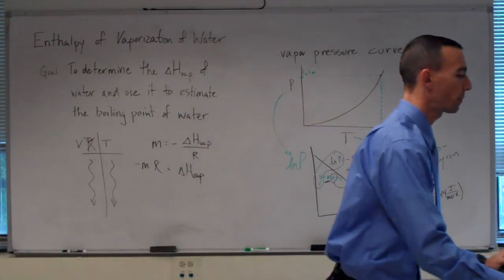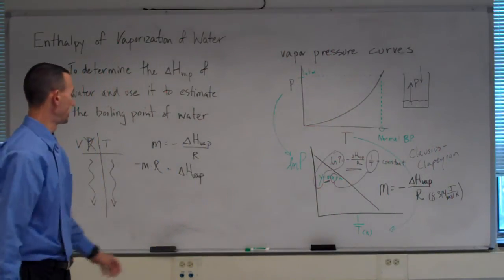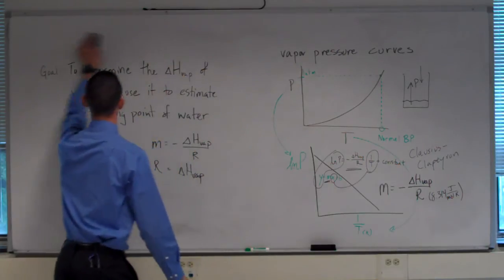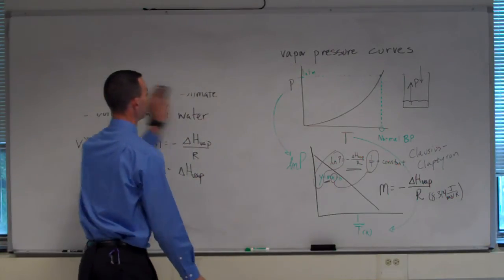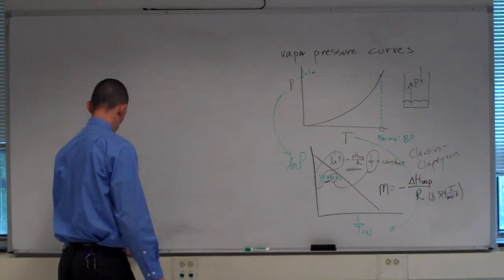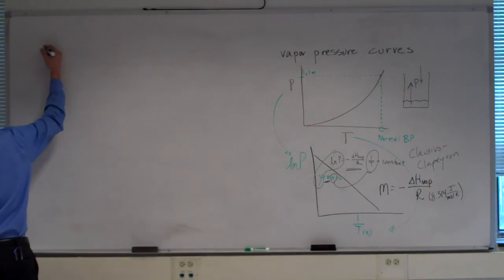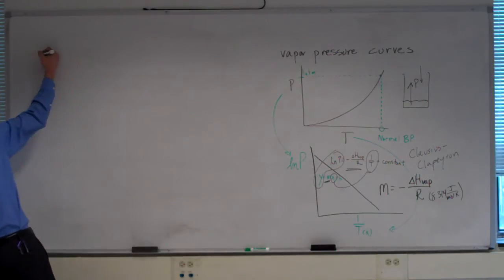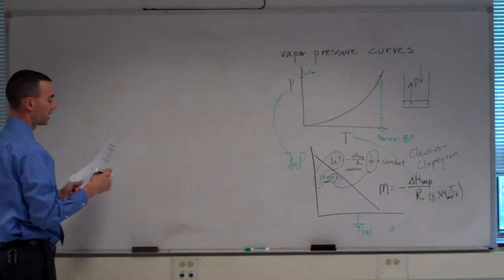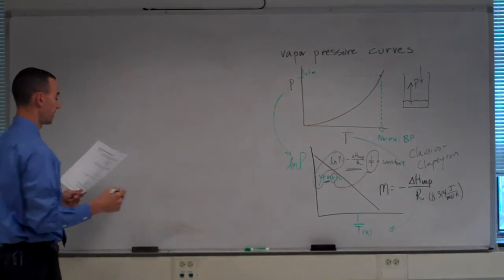Now let me go through the pre-lab questions that are part of this experiment. And a couple of these play a significant role in the calculations that you'll do as part of this lab. So let's pay good attention and make good notes of these in your laboratory notebook. Now the first one is actually just a refresher. We'd like to know what amount of acetone can be vaporized by 100 kilojoules of energy.